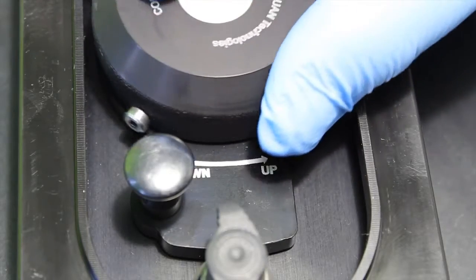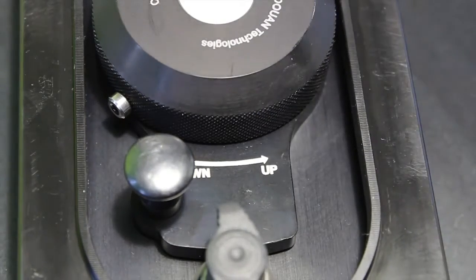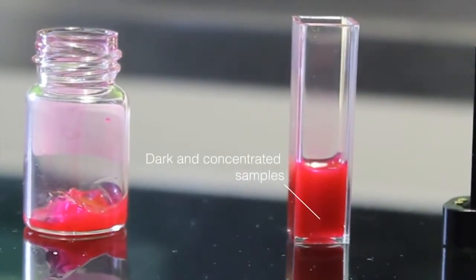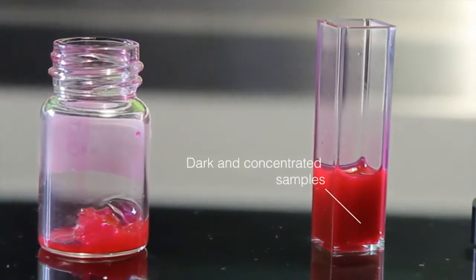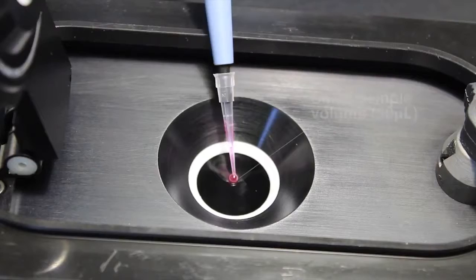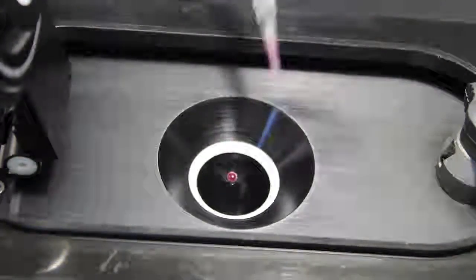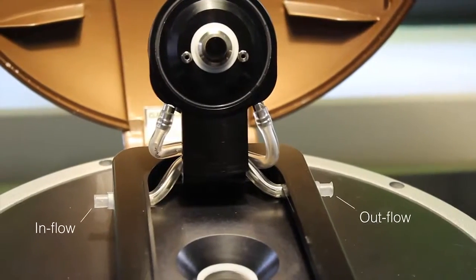The benefits of this thin film concept are numerous. A very broad range of sample concentration allowed without dilution or tedious preparation. Small sample volume. Online measurement capability without stop flow.